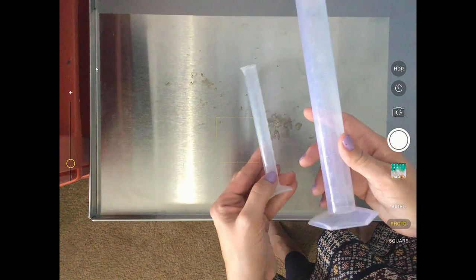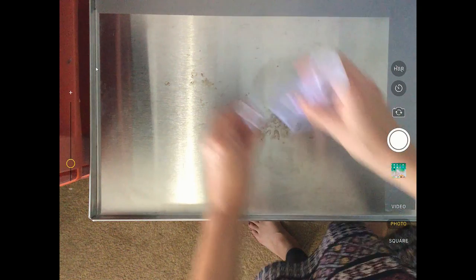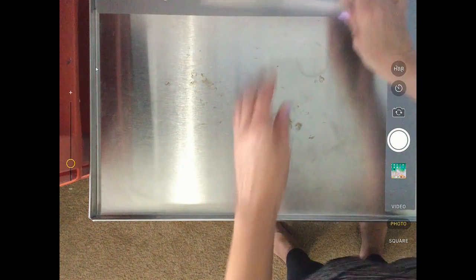Graduated cylinders do come in different sizes. You can have little bitty ones, you can have really big ones. I just brought a couple from my lab at home to my house.